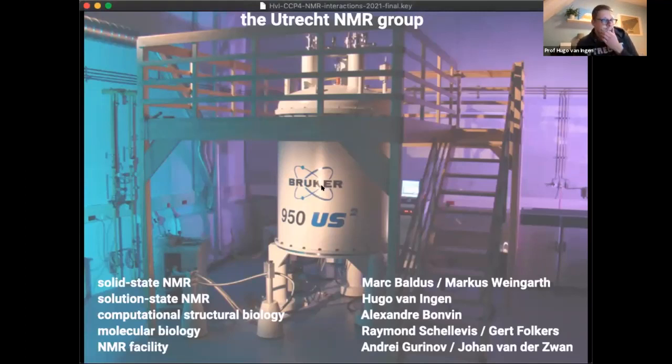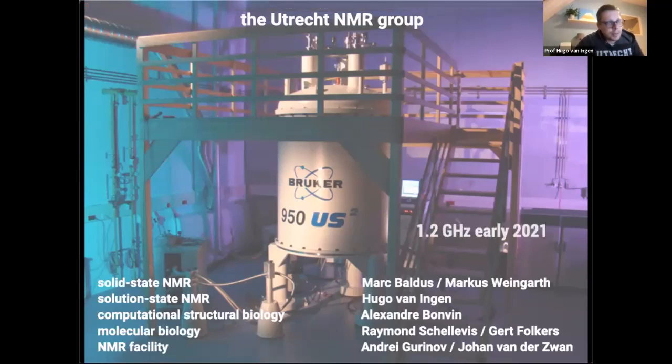And here you see also a picture of one of our NMR instruments. And actually this one will be moved later this month to make place for the most powerful NMR magnet available these days, that's operating at 1.2 gigahertz.